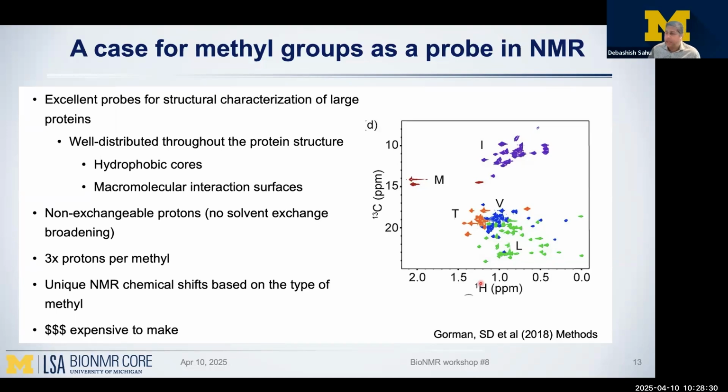Each one of these requires a metabolite that you need to specially order from different vendors. I can give you those catalog numbers as well as vendors and all that information. Contact me, and we should be able to figure that out. And there are a lot of review papers that talk about this as well. I can point you to those papers too.